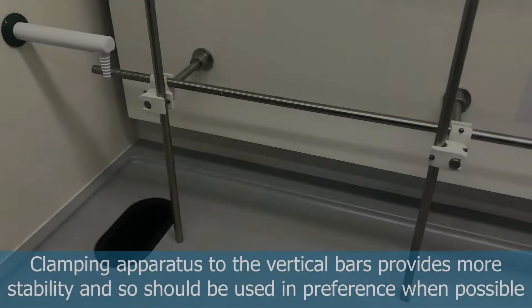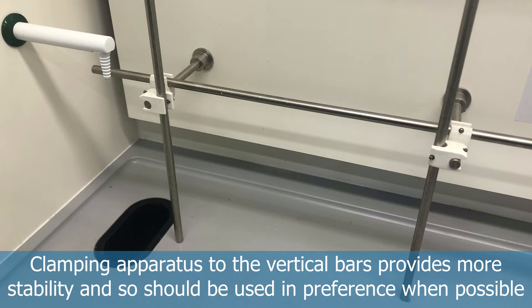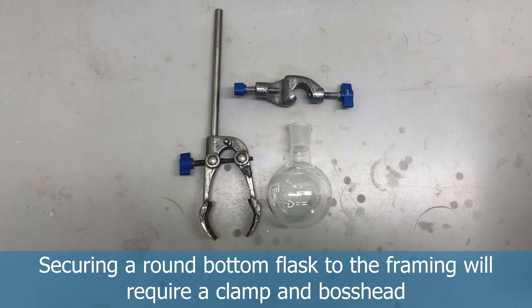When clamping your apparatus, you need to use the vertical bars on the frame and on the back, as these offer more security. The horizontal bars tend to wiggle about and are generally less secure. If we're wanting to clamp a round bottom flask, we need our boss head and our clamp.